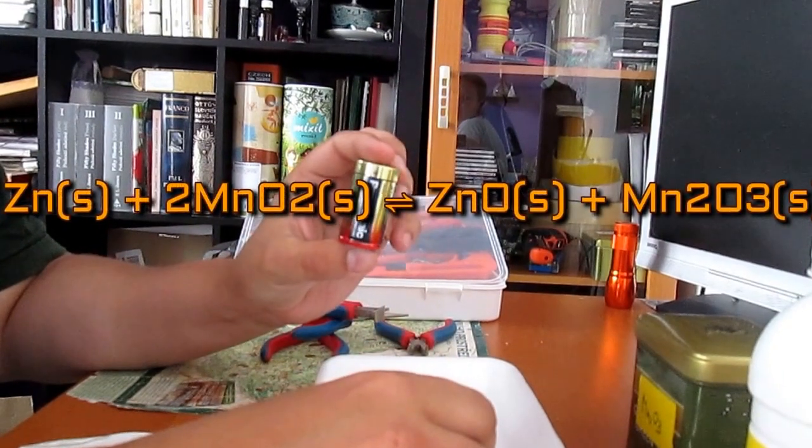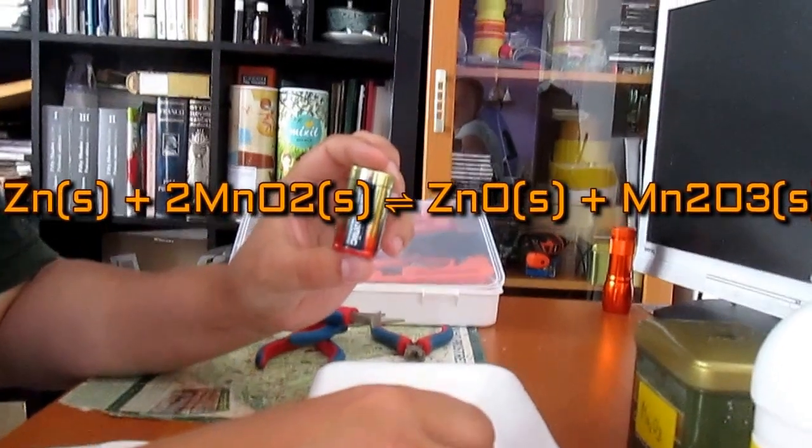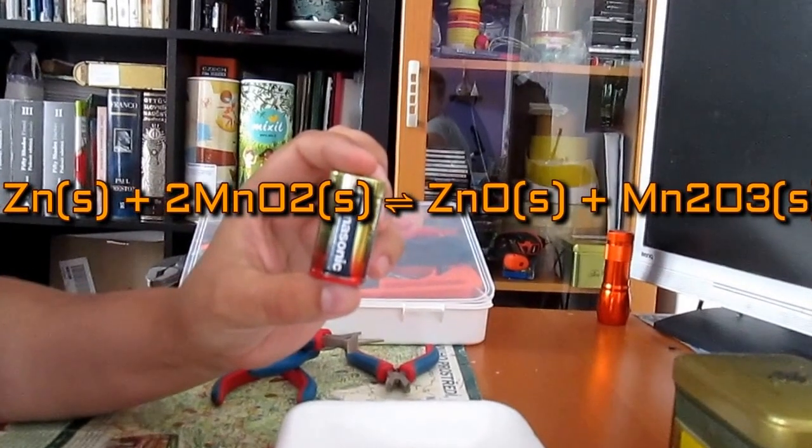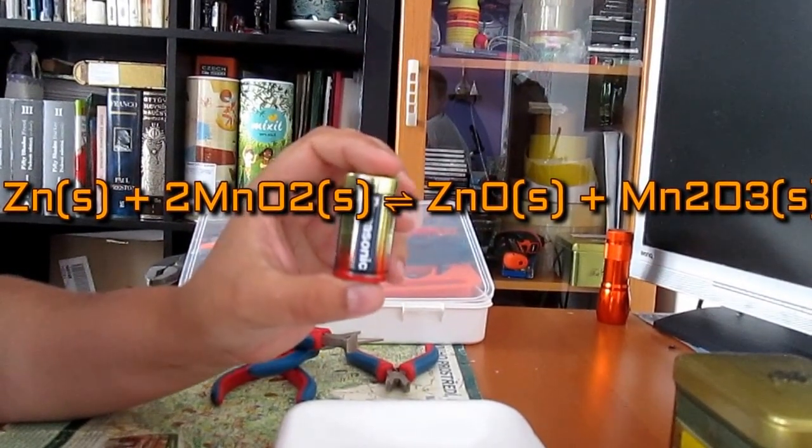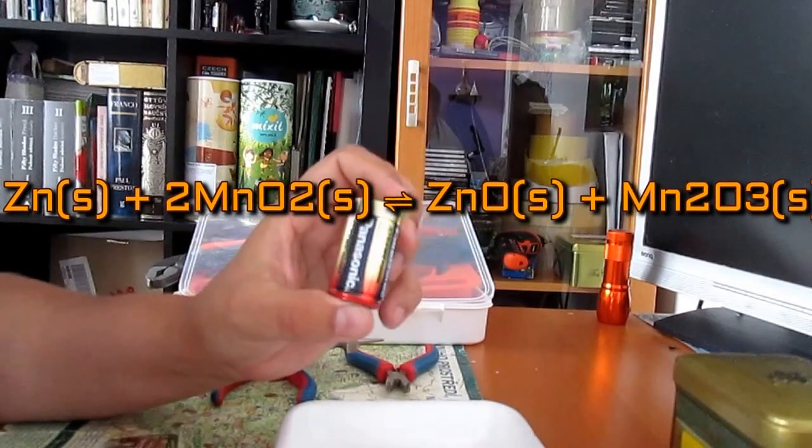We are in fact scrapping a discharged battery, so the compounds we are after are manganese oxide and zinc oxide.